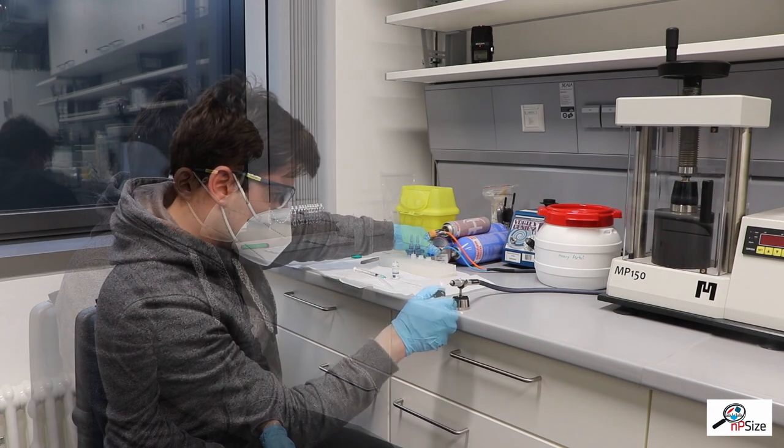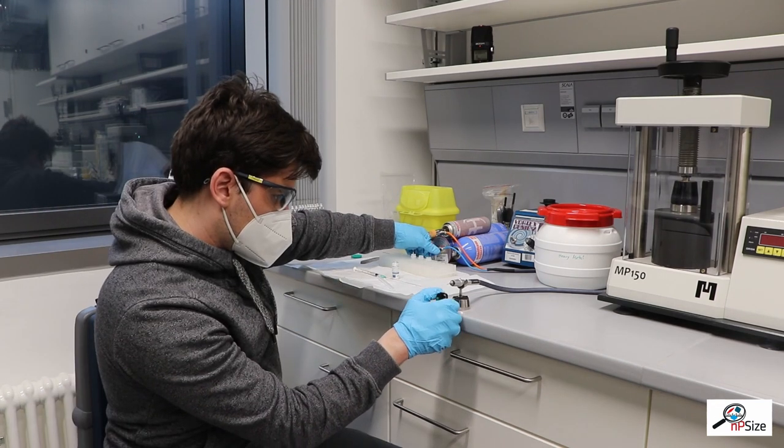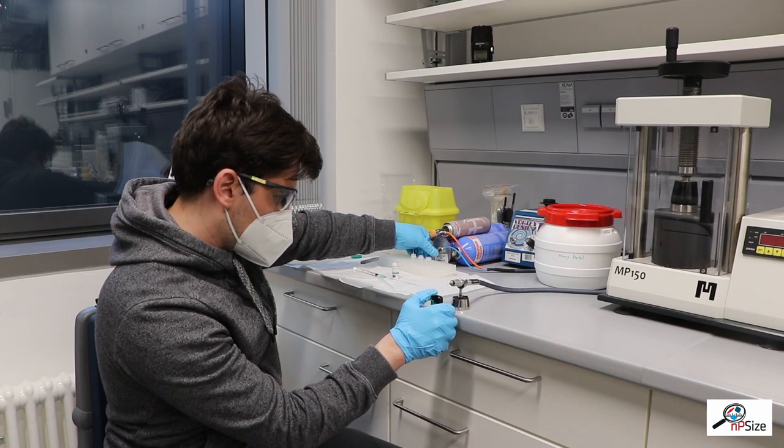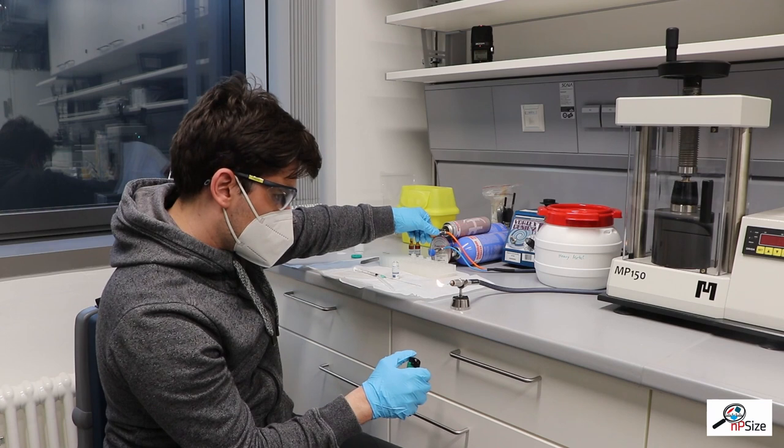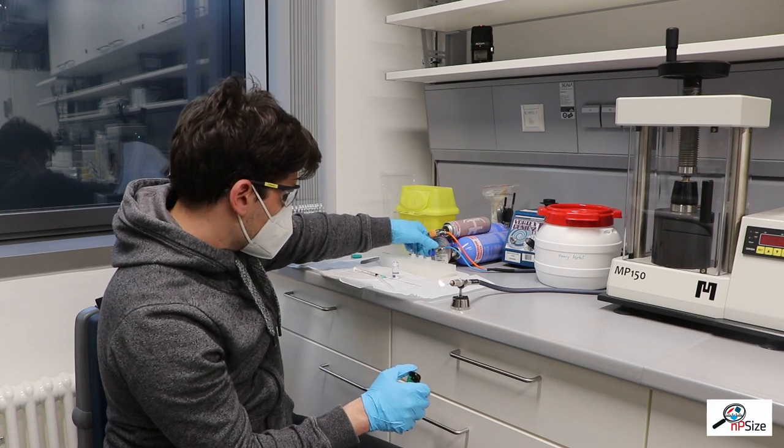The capillary is then closed by welding in the flame of a propane oxygen torch. The torch is extremely hot — it has a temperature of 2800 degrees Celsius.